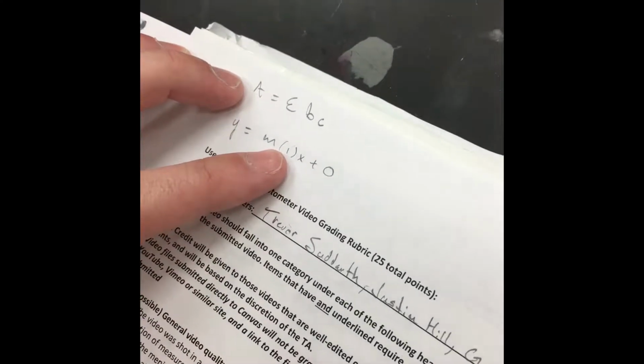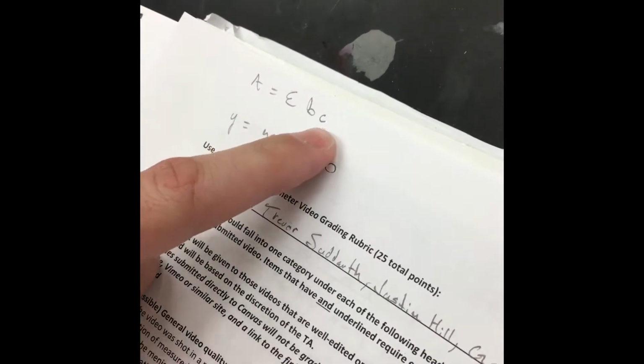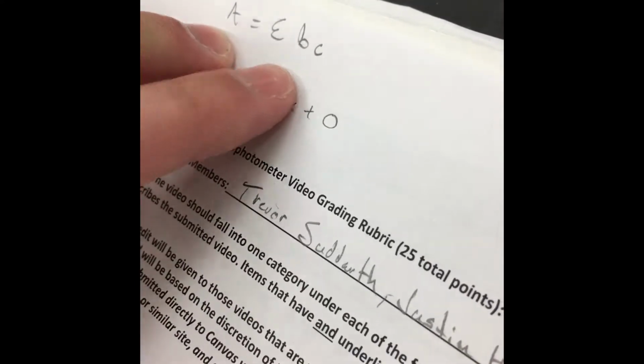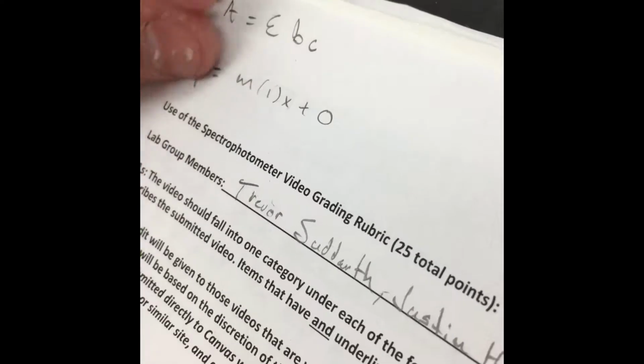So what that means is that on the graph, on the y-axis, we have absorbance, and on the x-axis, we have concentration. So in the equation, A is going to equal what y is on the graph. C is going to equal what x is on the graph, because that's concentration and absorbance. Epsilon is molar absorptivity, which is the slope of the graph of A plotted against C, which is absorbance plotted against concentration.